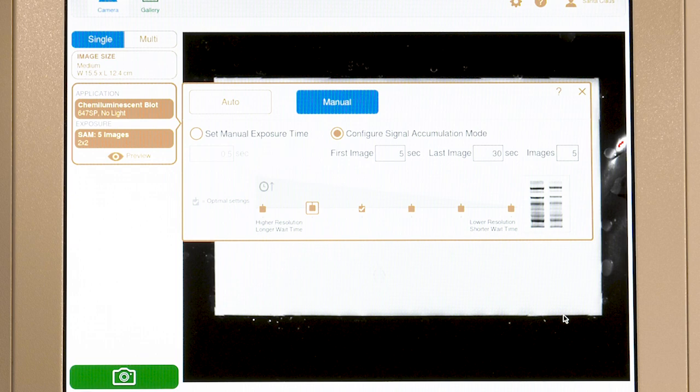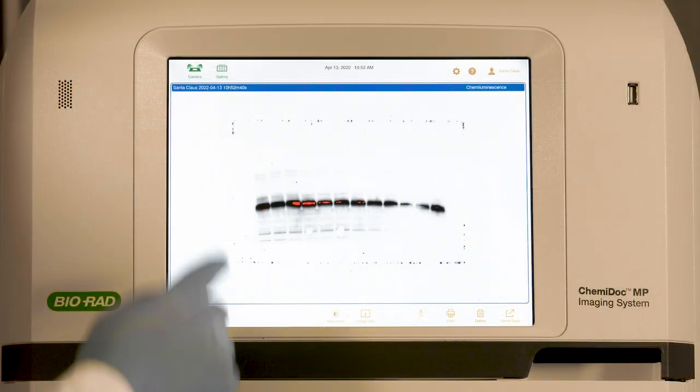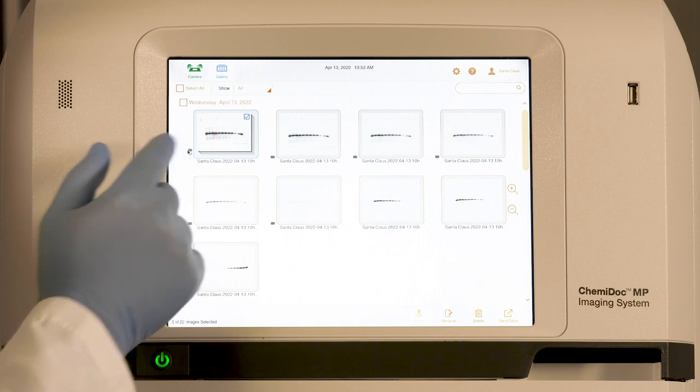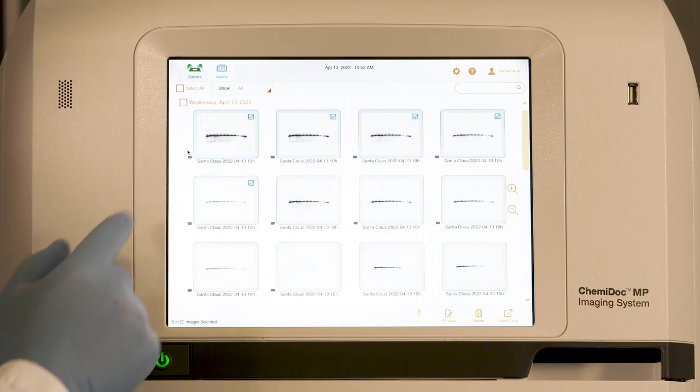For example, let's enter a minimum exposure time of 5 seconds and a maximum of 30 seconds. We'll take 5 images total. The instrument will acquire images at approximately 5, 11, 18, 24, and 30 seconds.